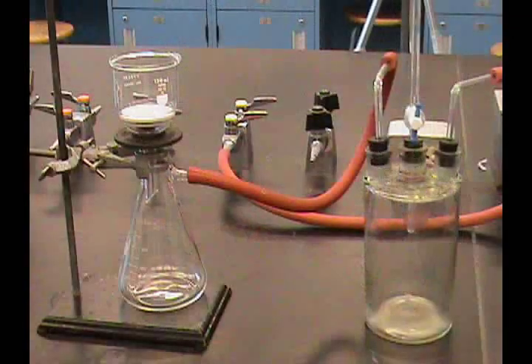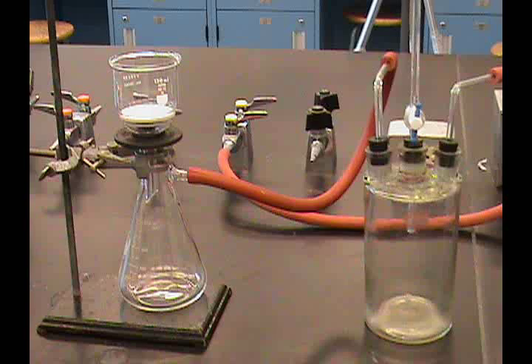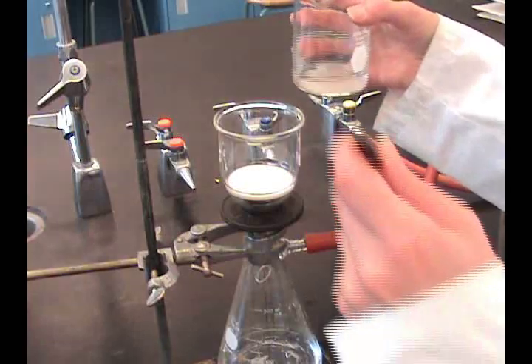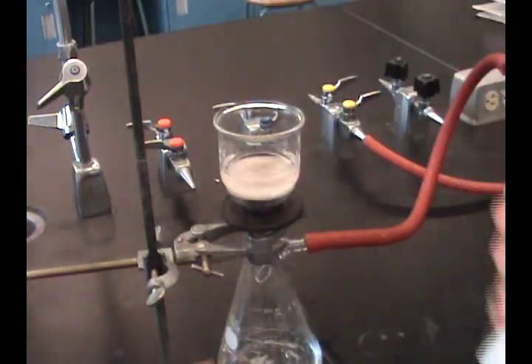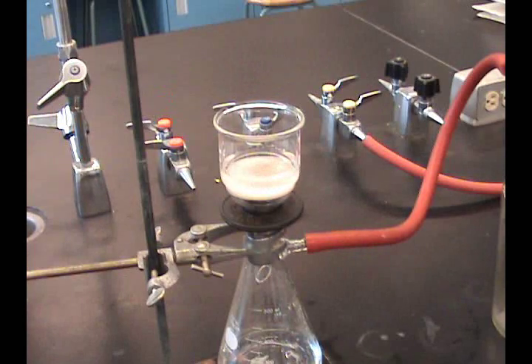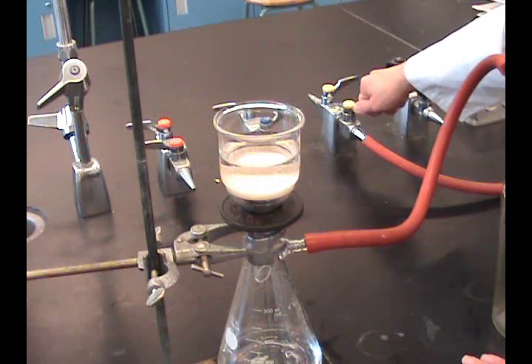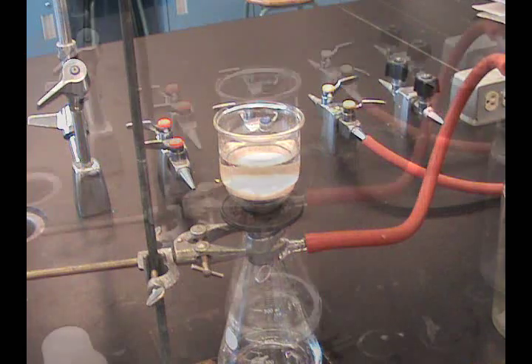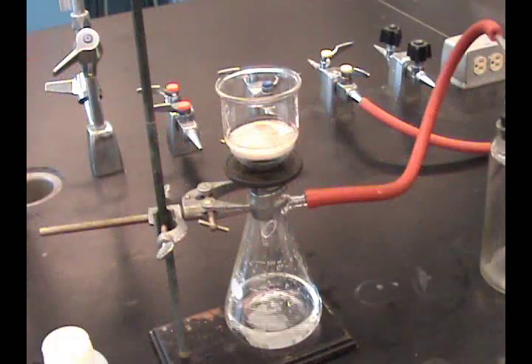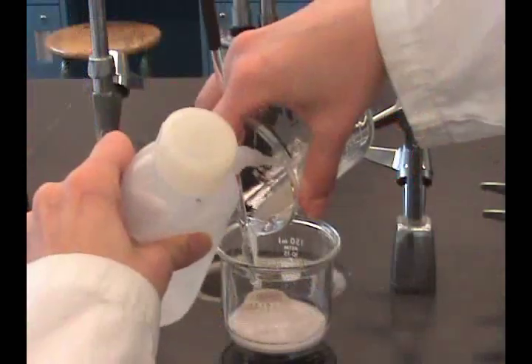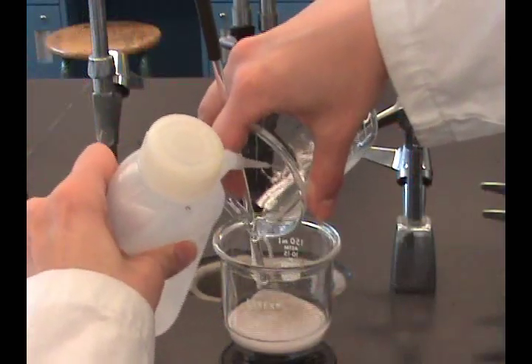If using a glass sintered funnel, no filter paper is needed, but the washer is to ensure proper seal. Pour the solution into the center of the funnel and slowly apply vacuum. Use a policeman to help transfer and rinsing should be done as well.